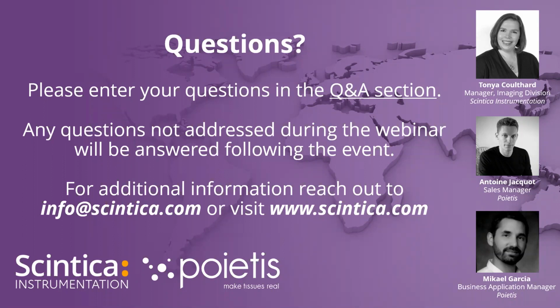Perfect. Go ahead, Mikael. I just want to add something. The heat of the laser is absorbed by the gold layer on the ribbon. That's why this layer exists, to prevent this kind of effect. So there is no heat on the cells, just on the ribbon.